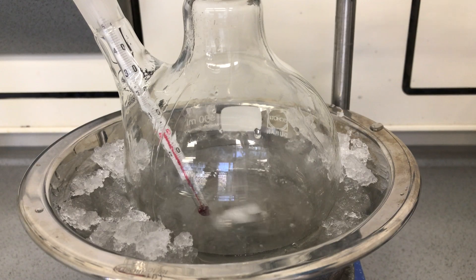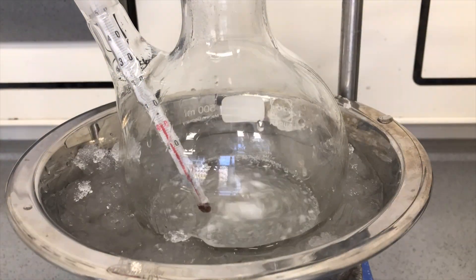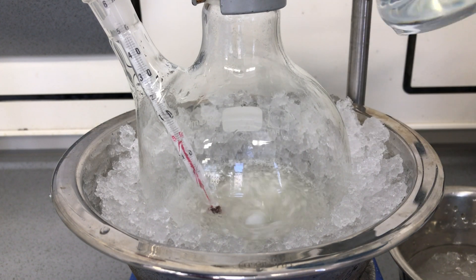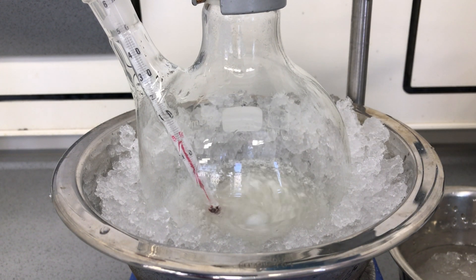The benzoic acid was very slowly added while keeping the temperature below 5 degrees C. The benzoic acid won't dissolve completely into the sulfuric acid, but we ended up with a nice suspension of benzoic acid.